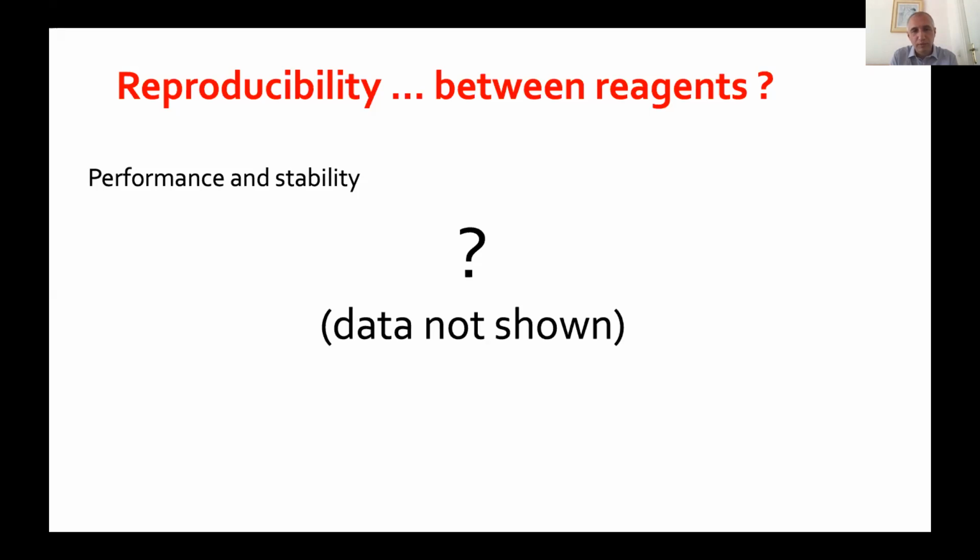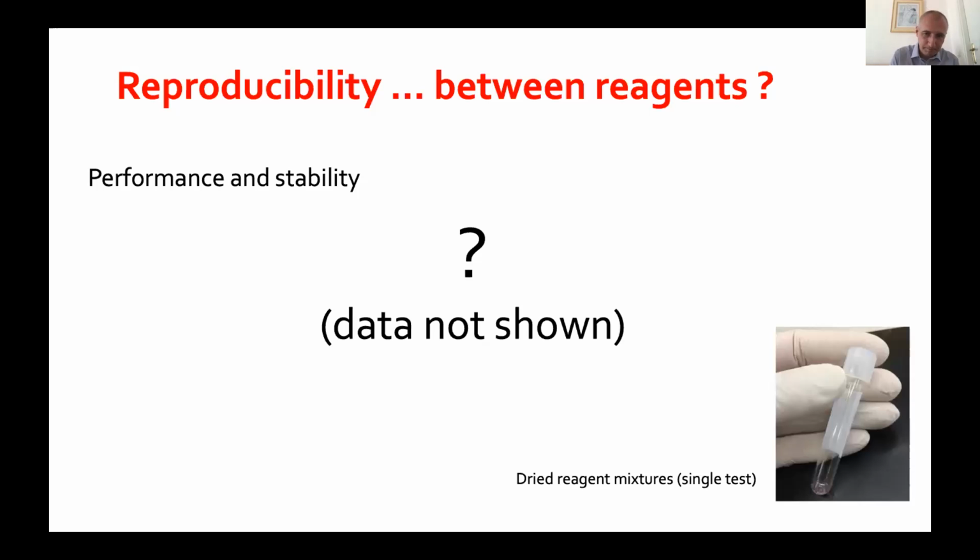And I think this is one of the points where we should probably negotiate with the vendors, that we want to know whether a given reagent is really a stable one, or it can differ very much. And it can be a biology. There doesn't have to be the same criteria for any different reagents, but we should probably have some benchmarking.